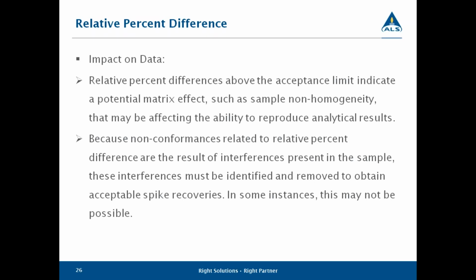By interferences, it's usually a situation where you have non-homogeneity in the sample. For example, a wastewater treatment plant is a good example, where you have a sample with a lot of solids that might be floating or suspended or settleable. Very, very difficult, and although we have great procedures here, as all labs do, to homogenize the samples, if you're pouring out 2 aliquots of the sample, it's very difficult to get a completely accurate representation of those solids out of the 2 pours.